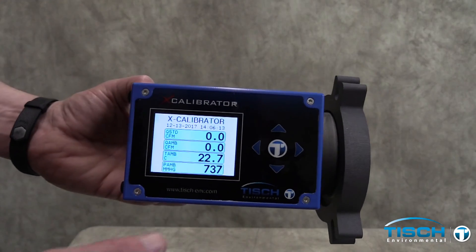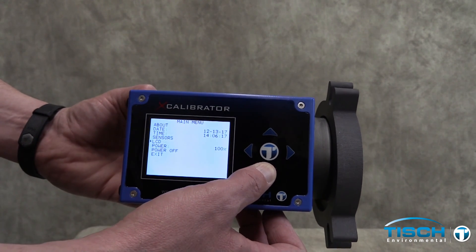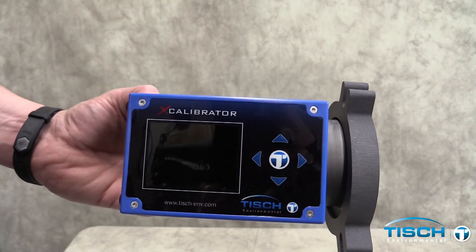To turn the calibrator off, press the left arrow key, then press the down arrow to select Power Off on the menu. Now press the main button to power off the device.